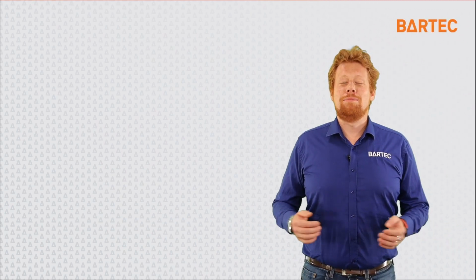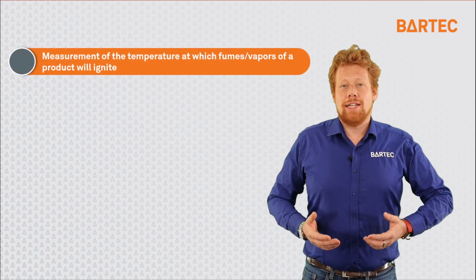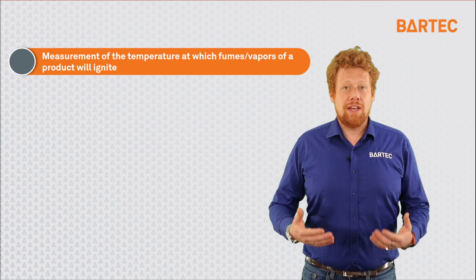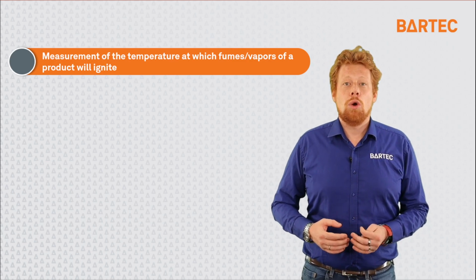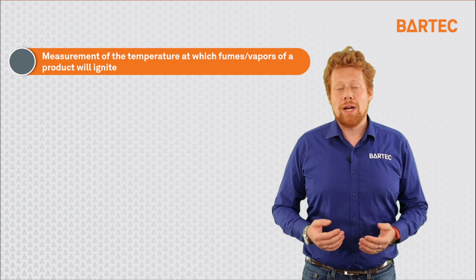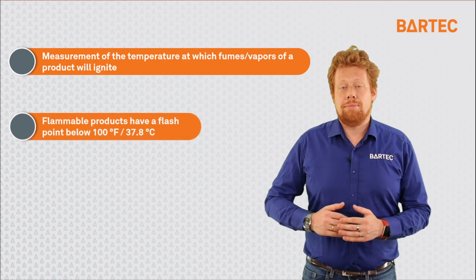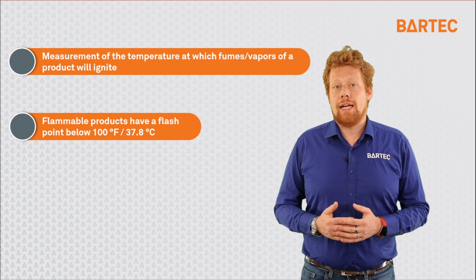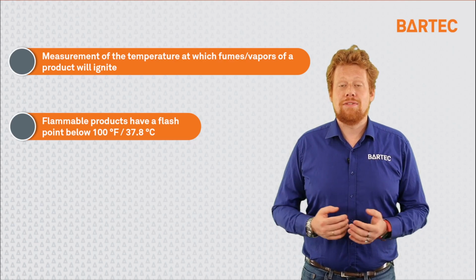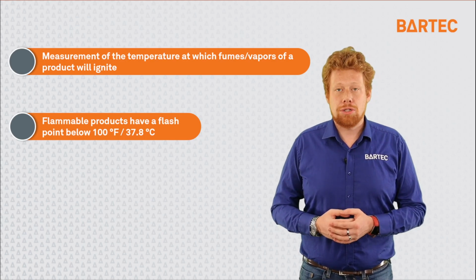Before we dive into P500, let's first take a look at what flashpoint is. Flashpoint is a measurement of temperature. It is the measurement of the temperature at which the vapors or fumes of a sample will ignite under an ignition source, such as a flame. In the US, flashpoint is used to define flammability and combustibility of samples. It is determined that products with flashpoint below 100 degrees Fahrenheit or 37.8 degrees Celsius are flammable and therefore need higher precautions when handling them.